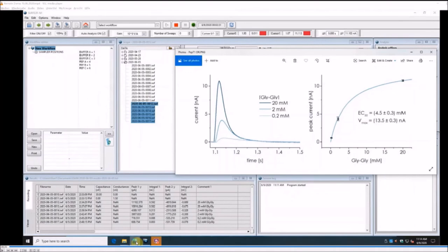Can the instrument be used to measure binding of a charged ligand to a membrane protein without transmembrane transport? Yes, it can, but the prerequisite is that the binding event needs to be electrogenic, meaning the ligand needs to trigger something within the protein which can be measured, like an electrogenic conformational transition or maybe an internal translocation of a charged ligand.